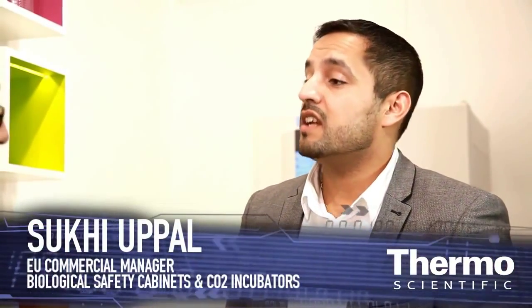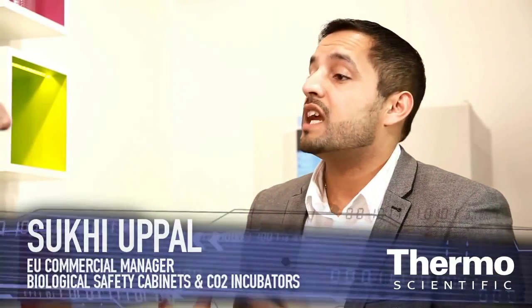Suki, talk about the Thermoscientific Heracell unit that we have here at the show. So the Thermoscientific Heracell 150i that we have here is our leading unit, and the reason we wanted to have it here today at Analytica is to introduce a new technology that we've pioneered, known as IonGuard.